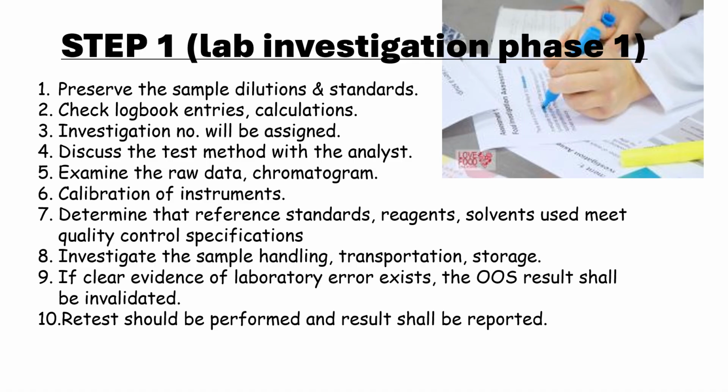So the role of the HOD during the investigation is, first, the analyst should be investigated. Second, whether the method was adequate for extraction of the analyte should be checked, and that there was no deviation in the method.